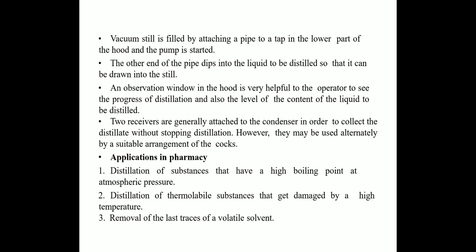Vacuum still is filled by attaching a pipe to a tap in the lower part of the hood and the pump is started. The other end of the pipe dips into the liquid to be distilled so that it can be drawn into the still. The observation window in the hood is very helpful to the operator to see the progress of distillation and also the level of the content of the liquid to be distilled.